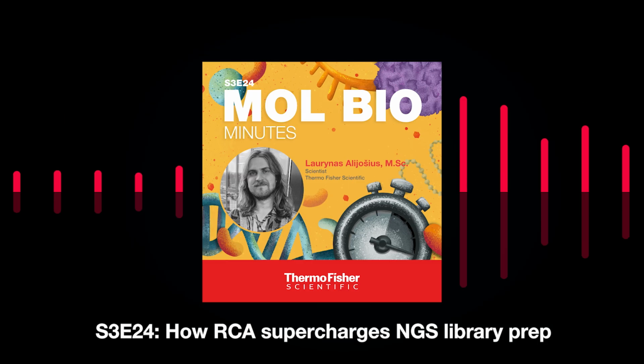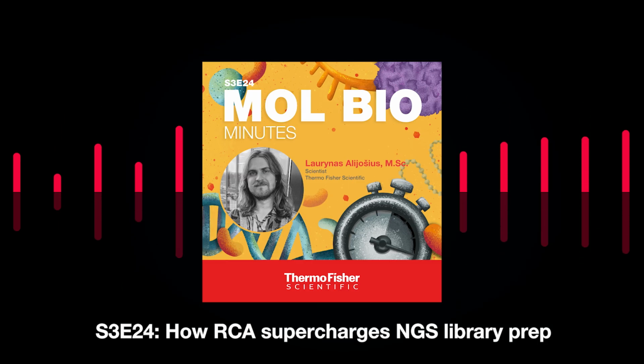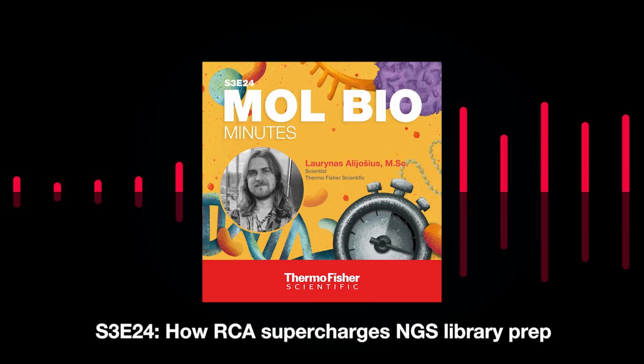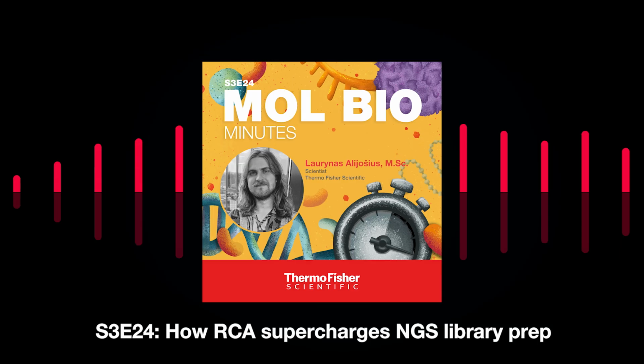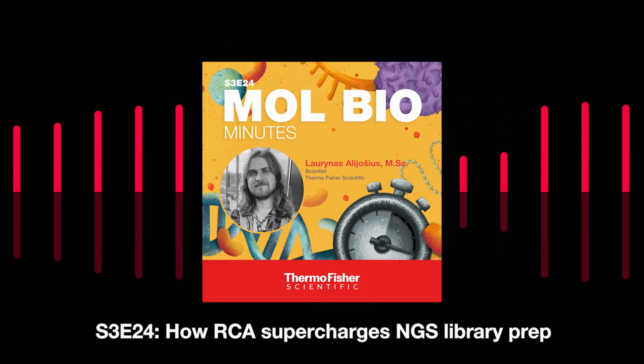And so RCA works in a similar fashion as we described MDA earlier. The polymerase rolls and rolls around the circular DNA template, then pushes out other DNA strands in its path, and keeps rolling around the circular DNA using it as a never-ending template. And ultimately, it produces a very long and branched DNA product.